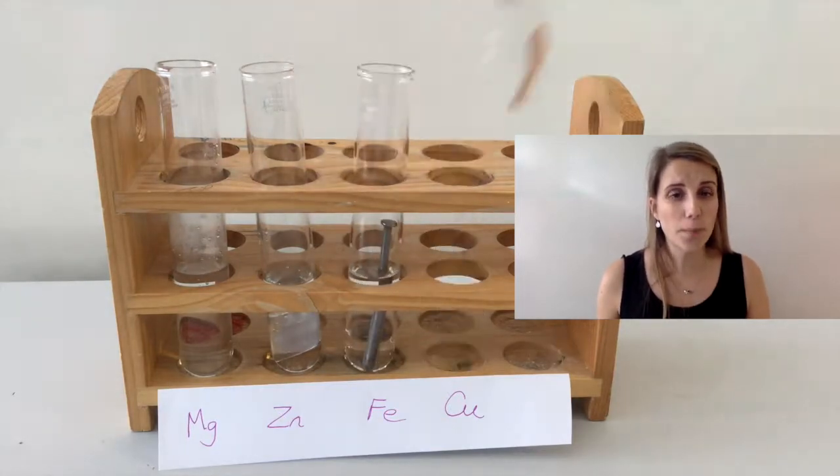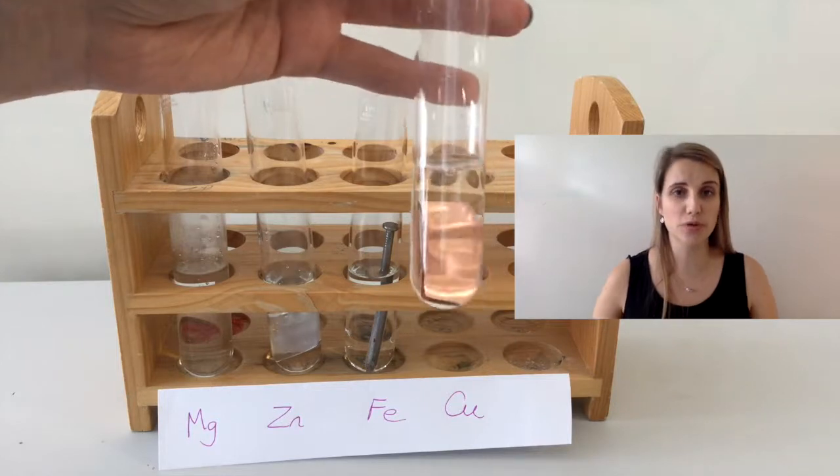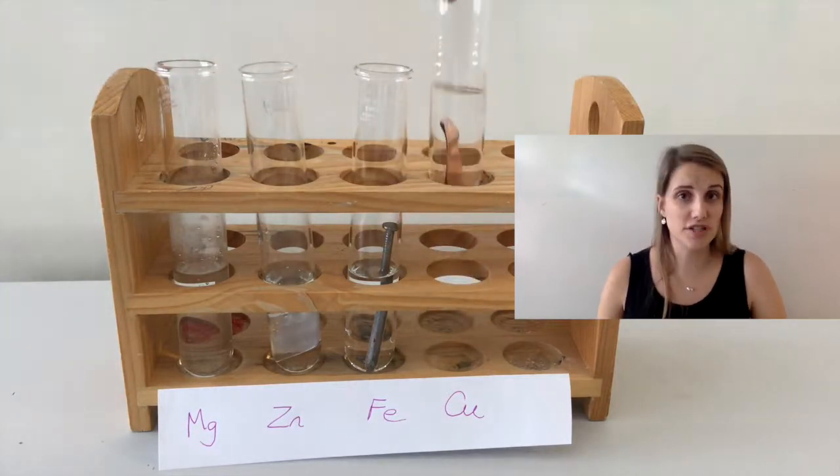If we look at the copper, it seems to not be reacting at all. There are no bubbles at all on the surface of the copper.